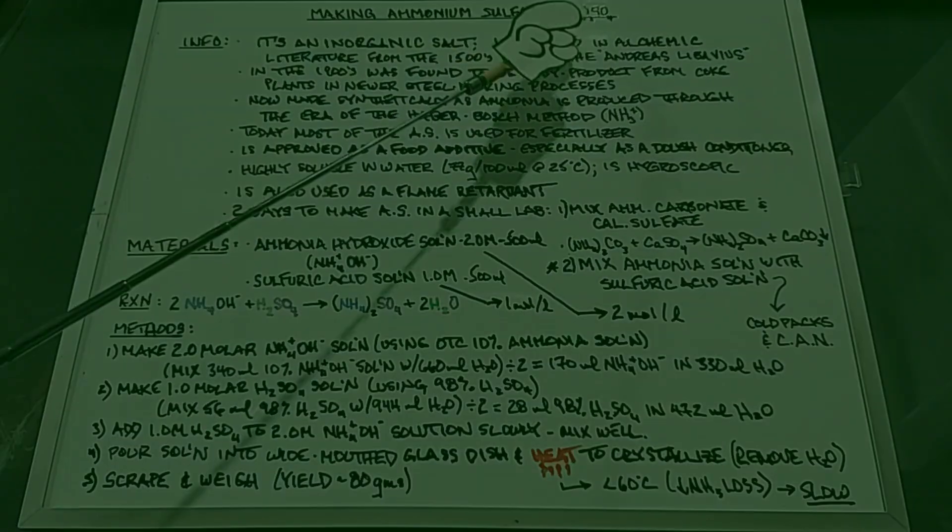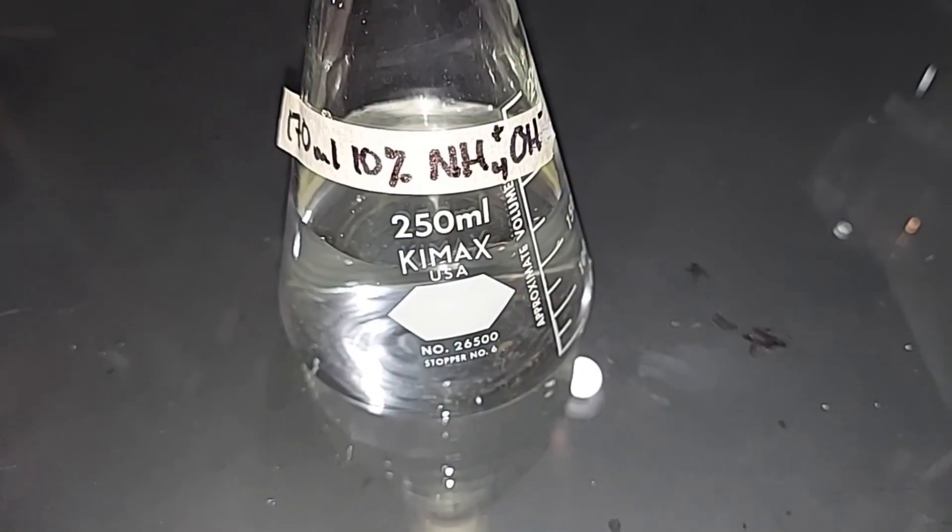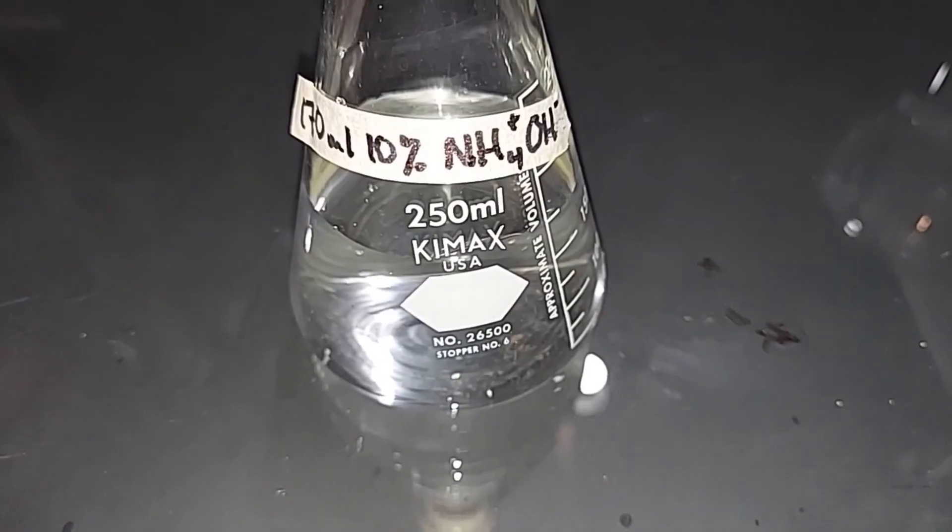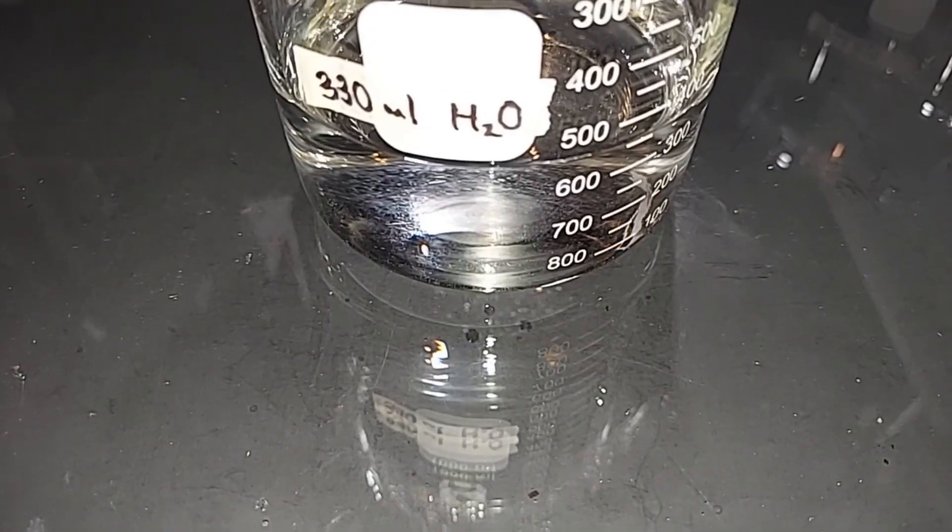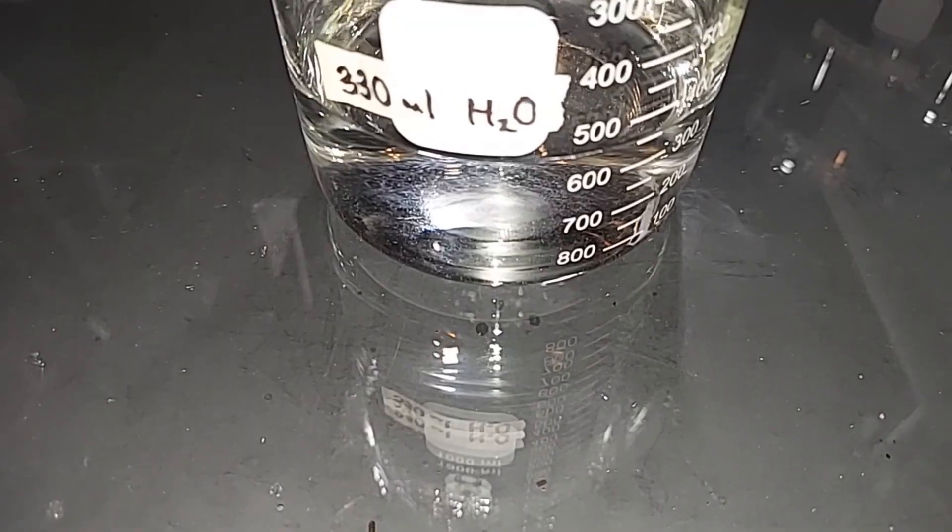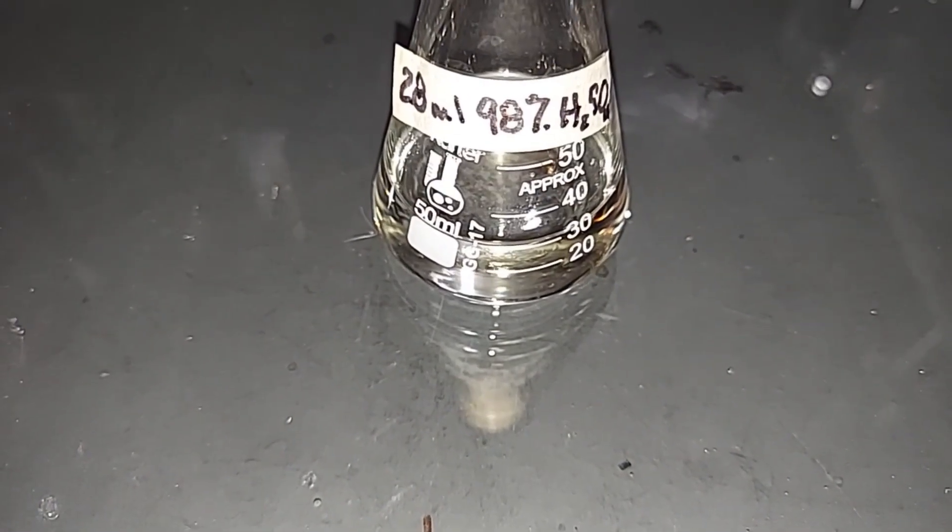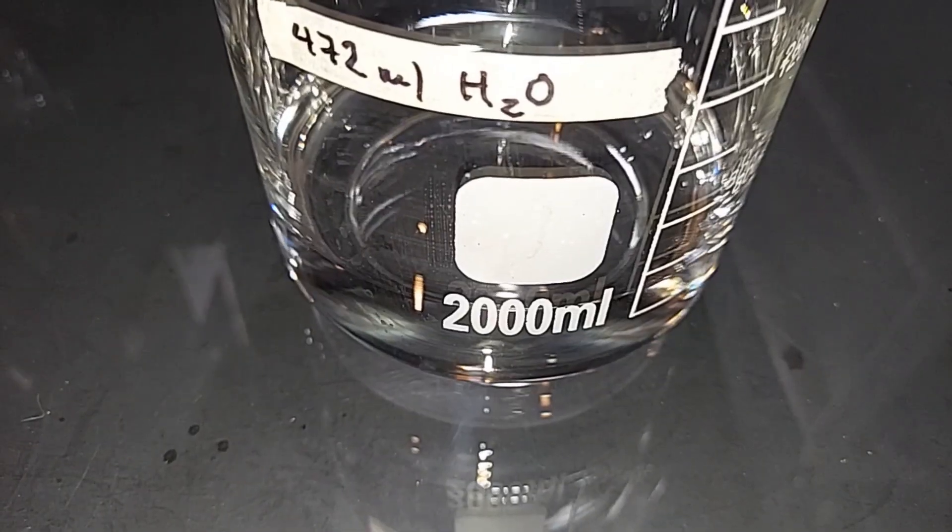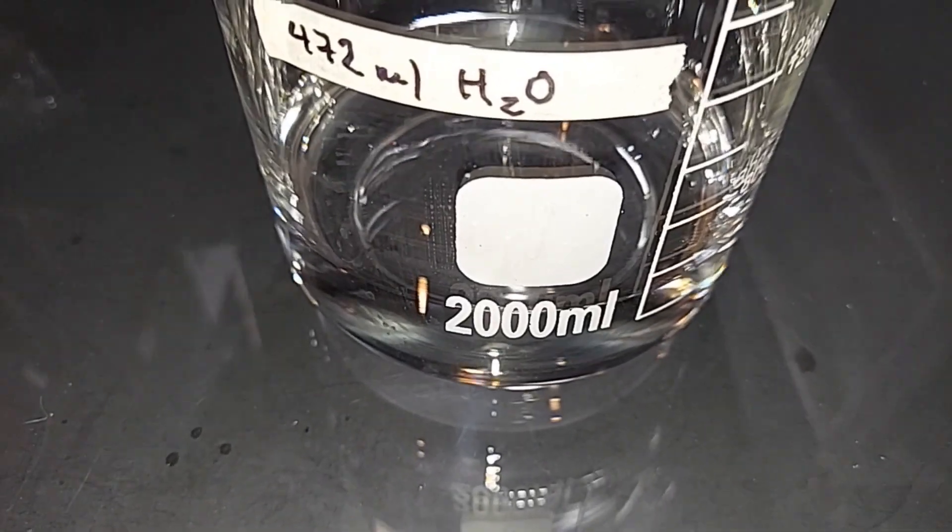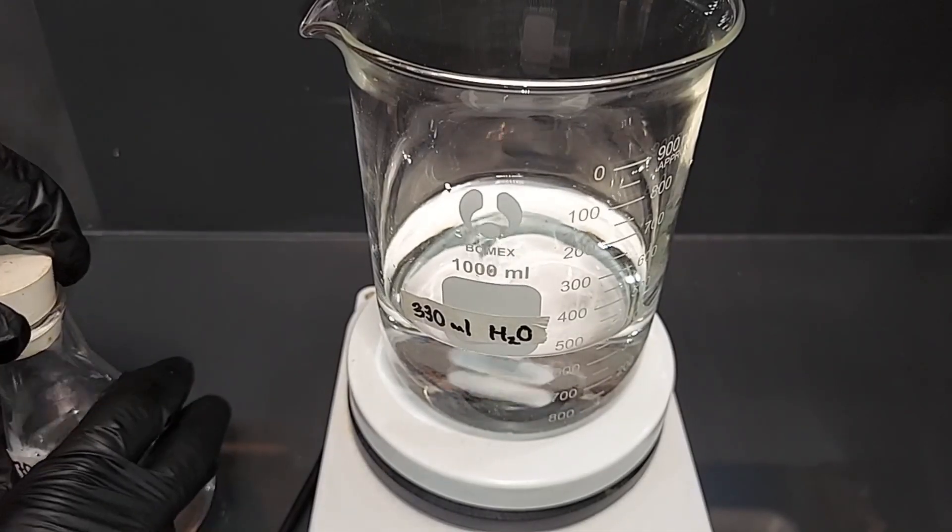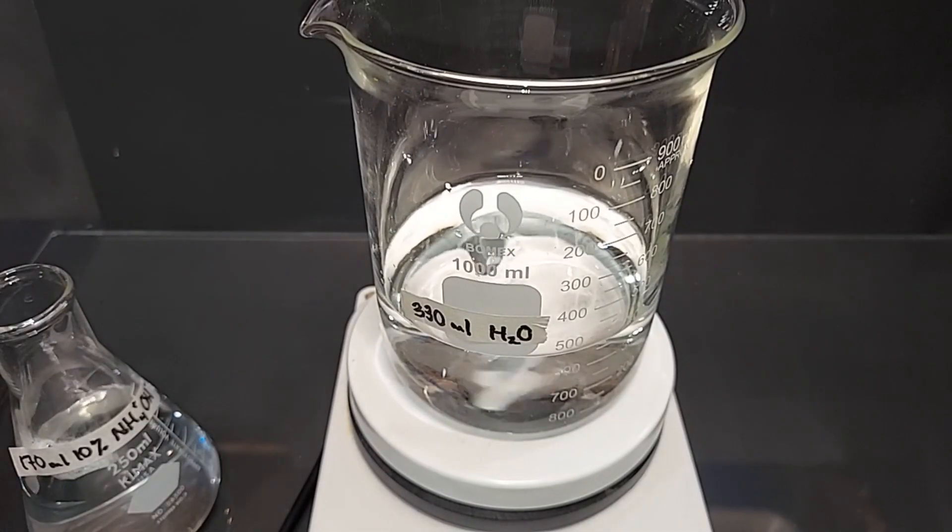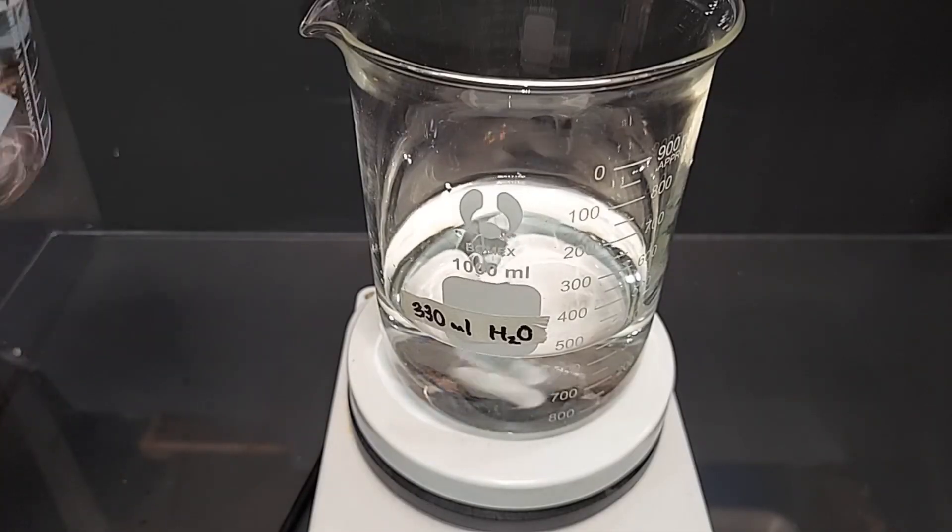170 milliliters of a 10% ammonia hydroxide solution pre-measured to be mixed with the 330 milliliters of water pre-measured. 28 milliliters of a 98% sulfuric acid solution pre-measured to be mixed with 472 milliliters of water pre-measured. Here's the 330 milliliters of water. I'm going to turn on the magnetic stirrer and start to add our ammonia solution here. This will make our two molar per liter solution.